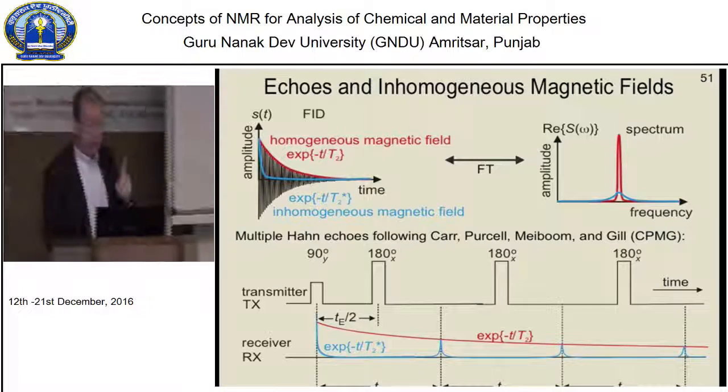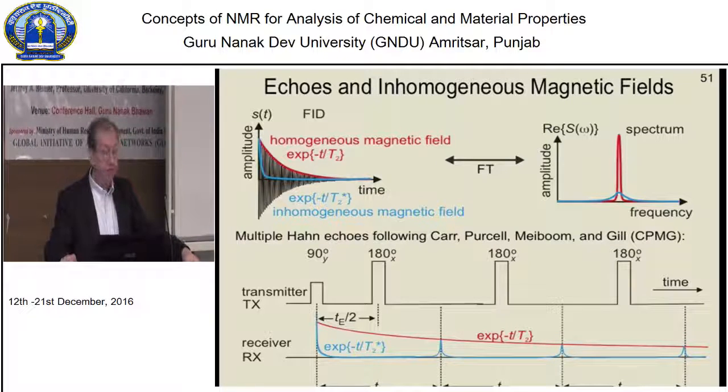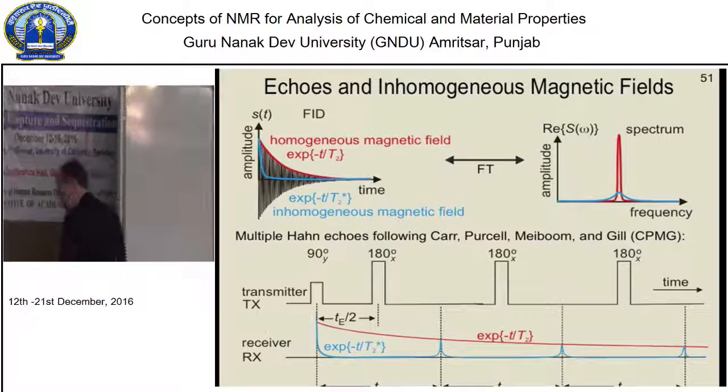Okay, so that's the T2 part. I will continue with T1 relaxation when we have revisited the rotating coordinate frame. And that probably takes a little bit more time. Let's do that.